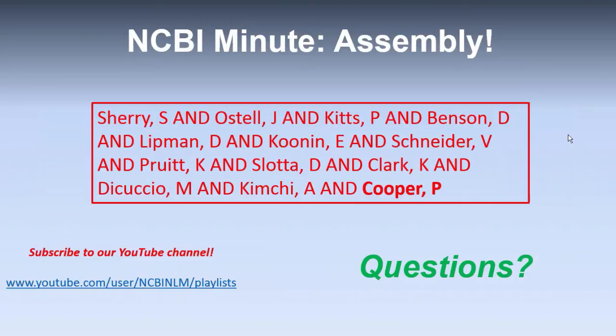All right, so this is a pretty good question. As a rank beginner to assembly, where would you suggest I begin? What I would do is go to the assembly database, and I would dive in head first. I would go to the assembly database, and I would look for your genome of interest, and I would try to download the FASTA file and do whatever it is you want to do.